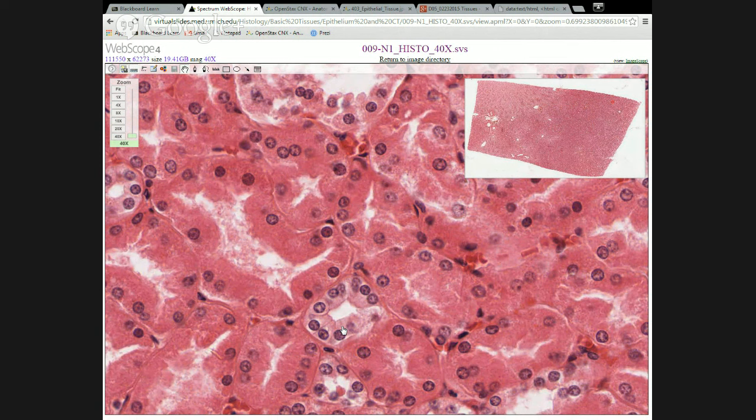It's a very small tube, so they're kind of really clustered together. They are, though it might not seem that way to you, they are in fact cuboidal cells. And I'll explain why that's true in a little bit. These might look kind of tall and thin or something like that, but they are in fact cuboidal cells.